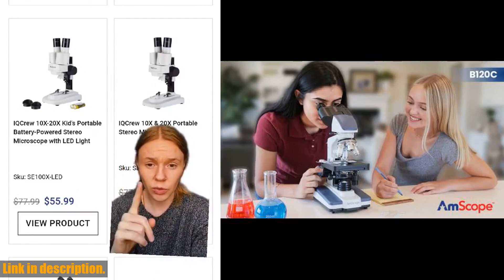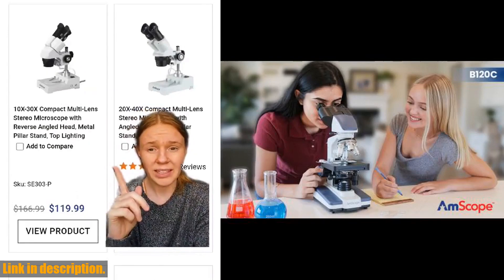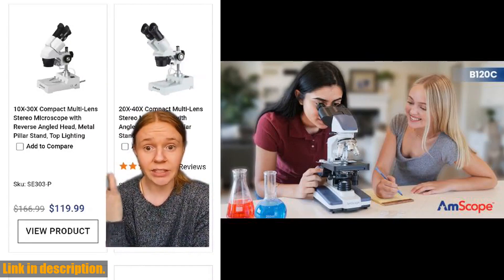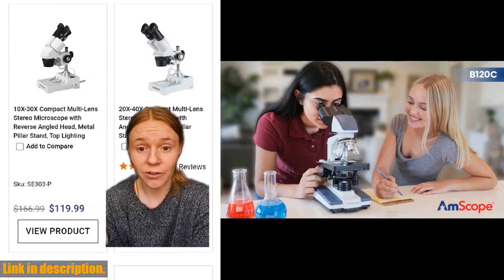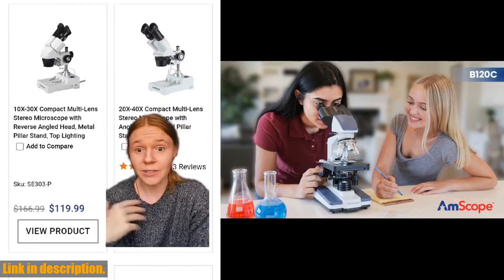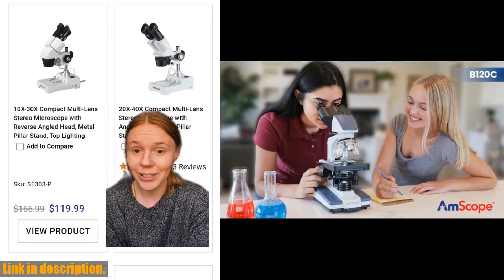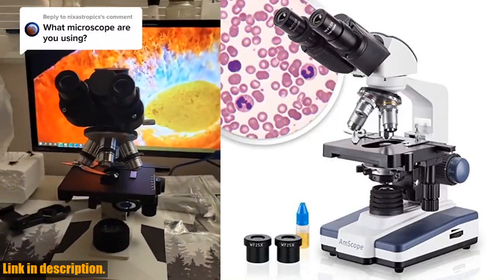The brightfield LED illumination and 1.25 NA Abbe condenser with iris diaphragm offer precise light control for crystal clear images. The double-layer mechanical stage allows for precise slide manipulation along the x and y-axis, with 1.0 mm stage divisions and locks to keep slides in place.